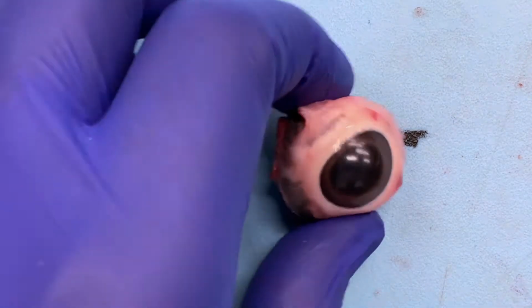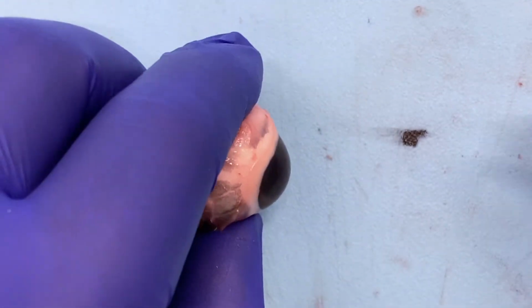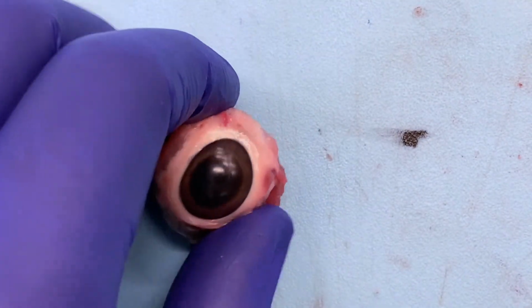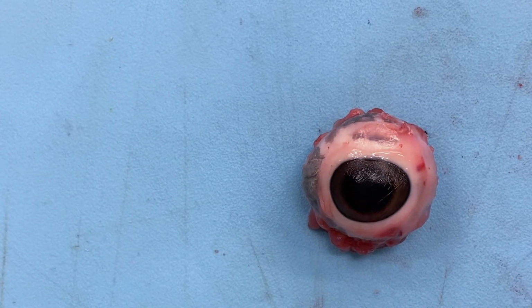Now, typically when you get these specimens, if you can, you'll have some sort of light source that you can use to do a transillumination. What that means is just holding up a light so that you can beam it through the eye and try to see where you get an area of darkening that would be an indication of where your tumor is. Because that's where we're going to make our plane of sectioning.